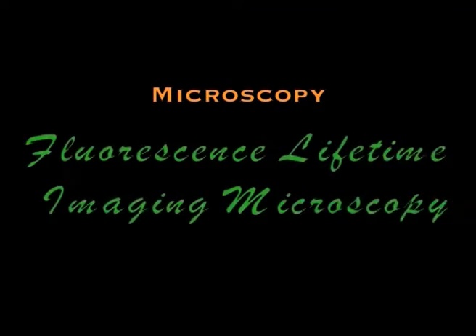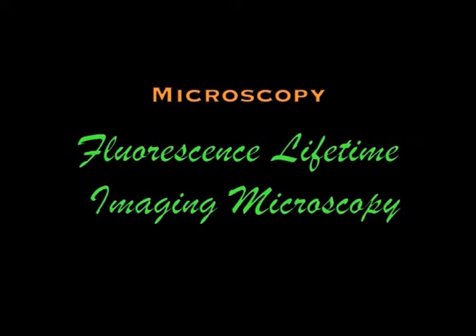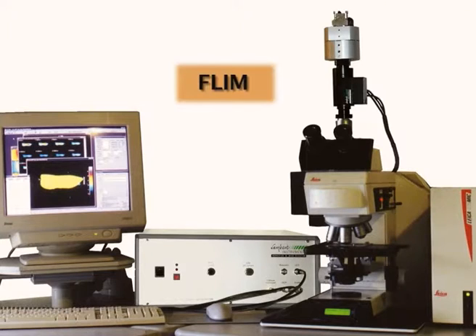Another assay that is used in fluorescence microscopy is fluorescence lifetime imaging measurements, or fluorescence lifetime imaging microscopy, which is FLIM. Fluorescence lifetime is defined as the time the excited electron spends in its excited state. Now, that is the lifetime of a fluorophore. Now, this is the backbone of FLIM.